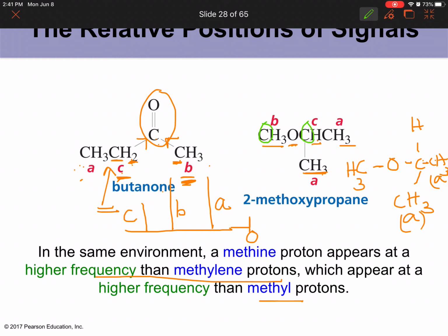And then the hydrogens on those carbons, B has 3 hydrogens, but the C has 1 hydrogen and then 2 carbons. So the C would be more deshielded because C hydrogens are connected to oxygen. C hydrogens, yes, are connected to oxygen, and then it also has 2 methyl groups, electron withdrawing, compared to hydrogens. So C would be more deshielded, and then B, and then A.